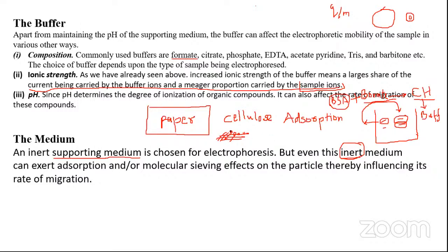And that is done by water molecules. So if certain water molecules are held onto paper and they were a part of the solvation shell, what will happen to your charged entity? It will also not move. Yes, it will be retarded. To be more precise, it will be slightly held to the paper, continuously. Just imagine a ball moving with all the water molecules at the periphery, and there is a paper below it. Certain water molecules will stick onto paper, retarding the movement of this ball further, and this will continue over and over again. You are getting the point, right?